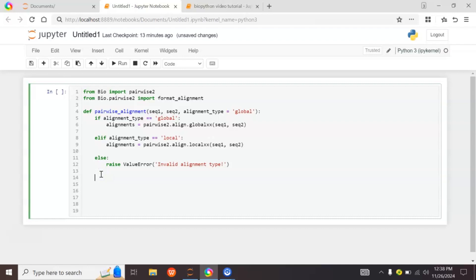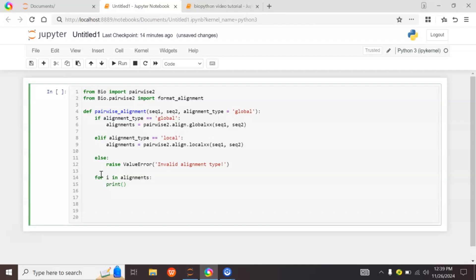To display the alignment results, we use a for loop to iterate through the alignments. Each alignment is a tuple, and we use the format_alignment function to unpack and display it in a clear format: for i in alignments, print format_alignment(*i).